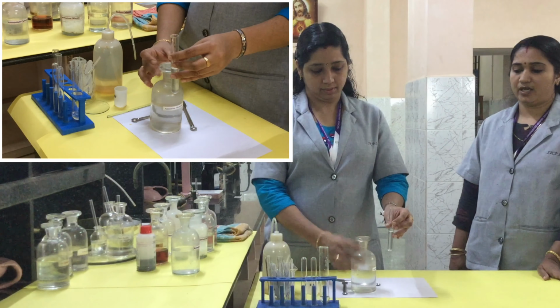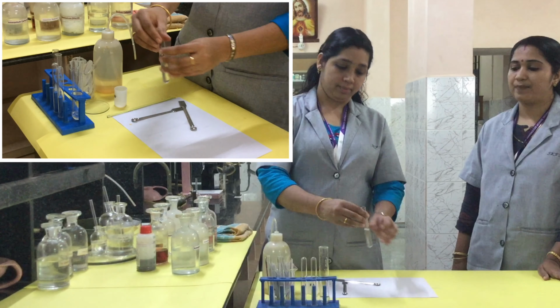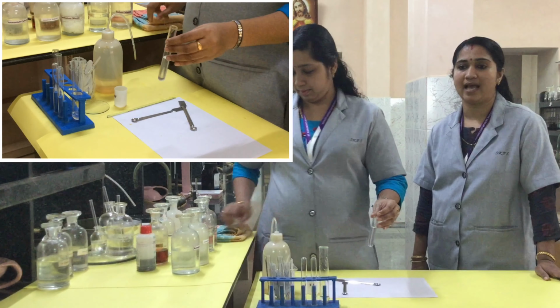Now just observe the change. There are no residues formed. So the absence of group 3, that is the aluminium cation, is confirmed.